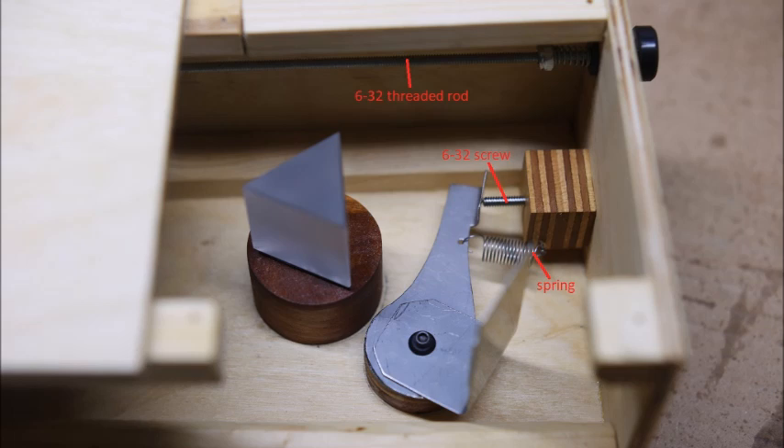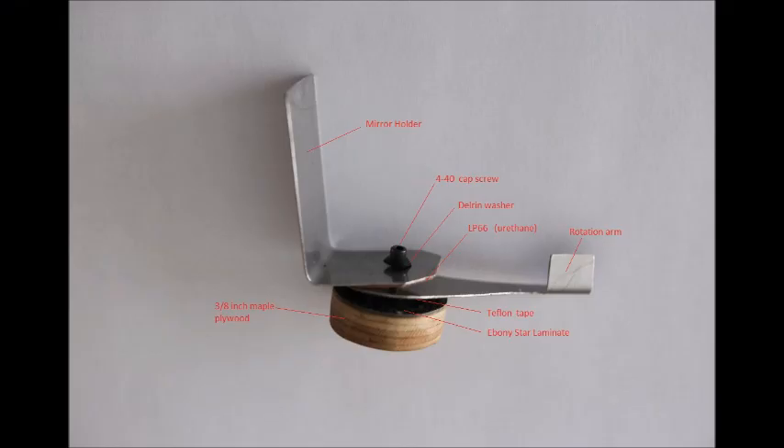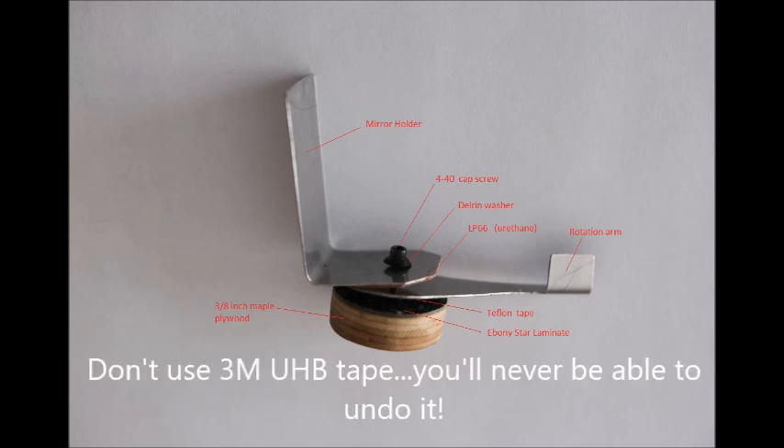The prism is mounted with two-sided tape on a disk of hardwood, 0.93 inches thick. A center screw holds it in place and allows the prism to be rotated. The mirror rotator has a lever arm with Teflon tape on one side riding on Ebony Star for low friction, and 0.020-inch urethane on the other side for high friction. The lever arm is pushed by a 6-32 screw and spring but can be manually moved for coarse adjustment. The base is mounted with two-sided tape and the mirror with 3M mounting tape.